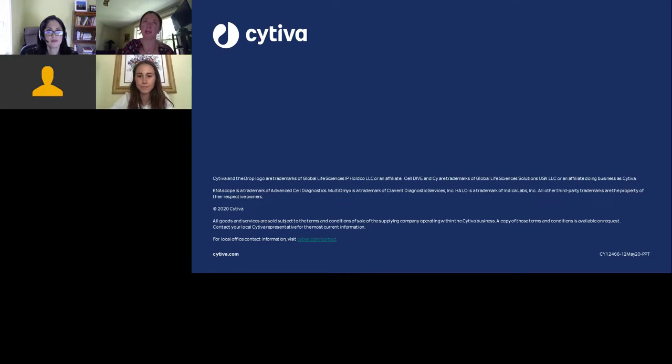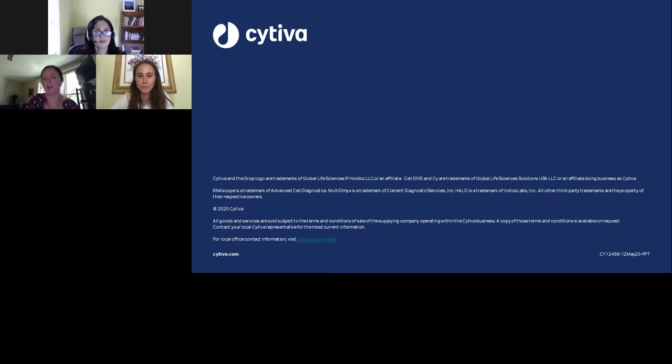But for the inherent fluorescence, that can be subtracted from your image prior to the staining step, and that increases your signal to background ratio. So hopefully that answers the question, and I'm happy to answer anything else you have in that regard.